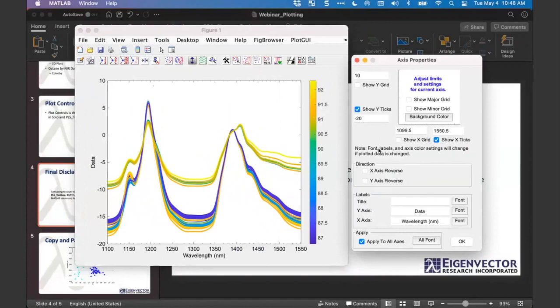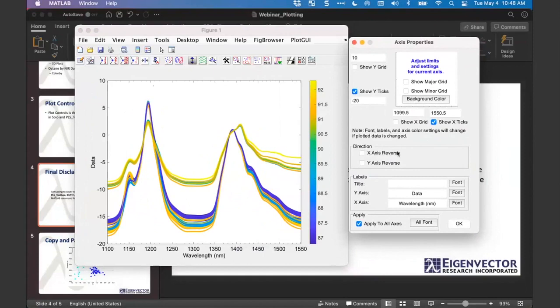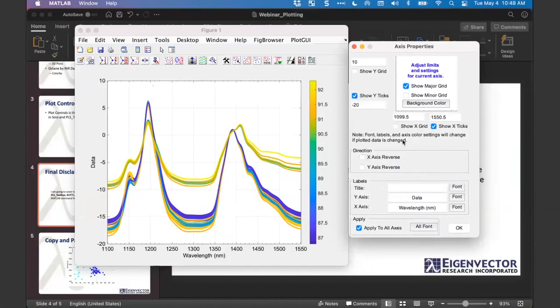I do not recall where. It was in here somewhere. About the y-axis. I could swear I saw that one earlier today. About show xtick labels. Oh, these ones, the actual labels. I'm not sure. Maybe I saw that in one of the windows that you had up earlier. Yeah, me too. It doesn't come to me right now.